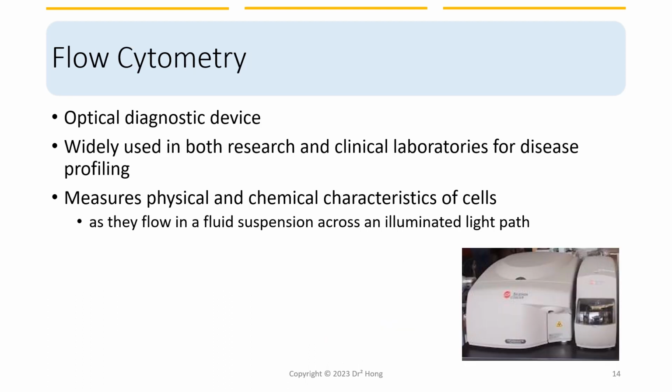So what is flow cytometry? It is an optical diagnostic device that is widely used in both research and clinical laboratories for disease profiling. It measures both the physical and chemical characteristics of cells as they flow in a fluid suspension across an illuminated light path.